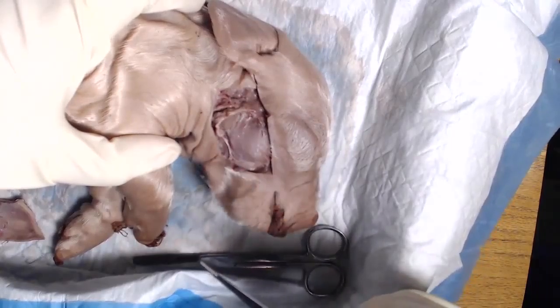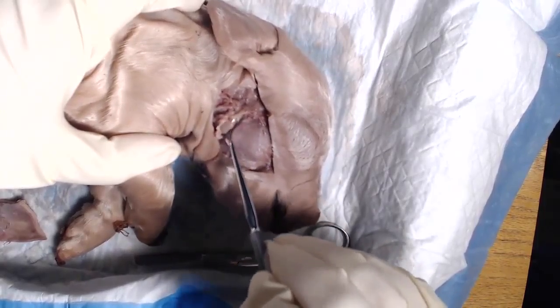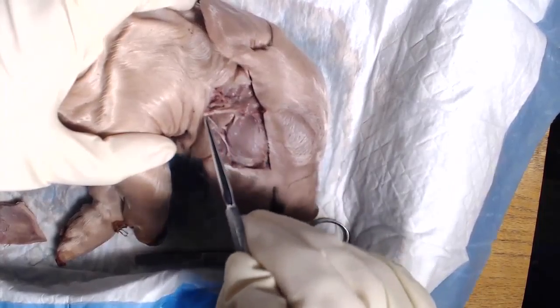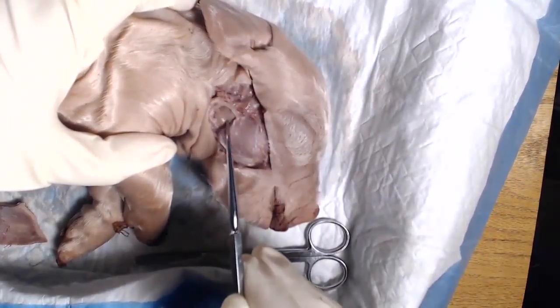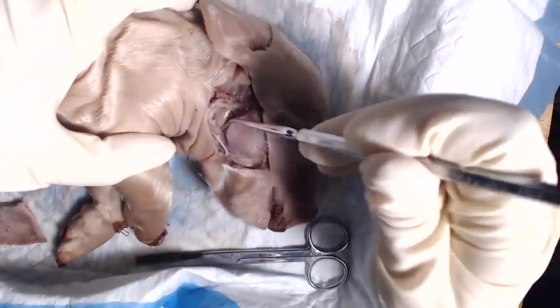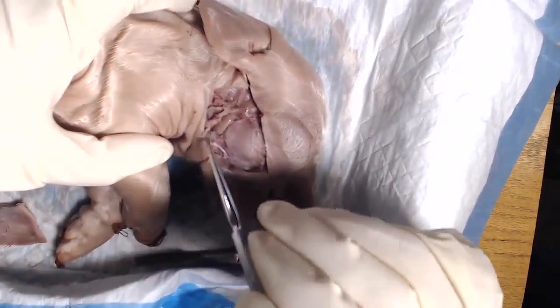That's another gland, which is our submandibular gland. Here on my pig, we can see it right here. I'm separating the masseter away from this gland. You can see it poking out right here, the submandibular gland. It's more round and easier to identify than the parotid.